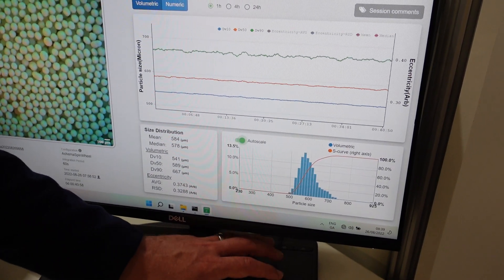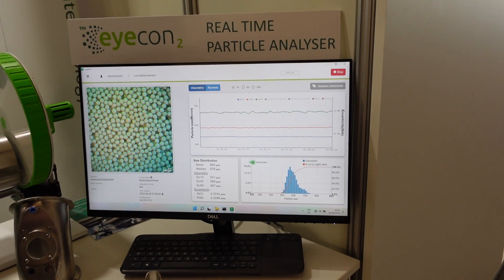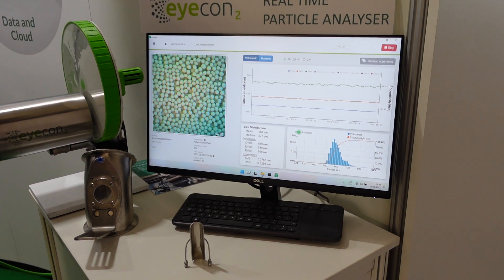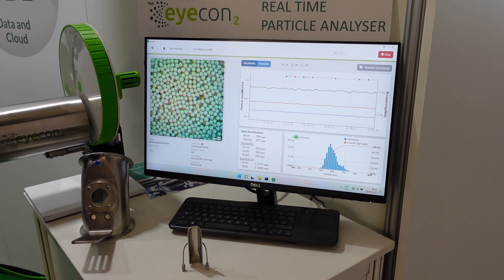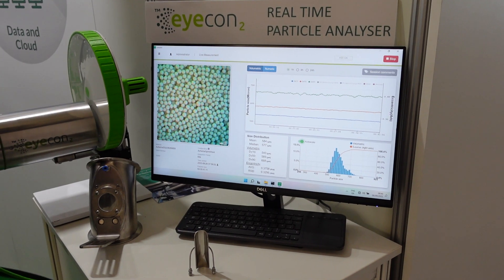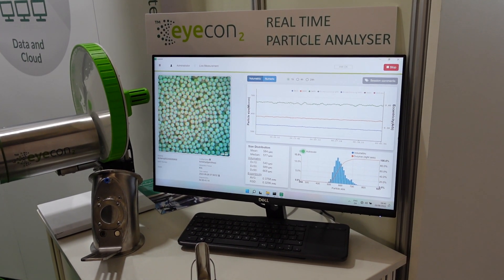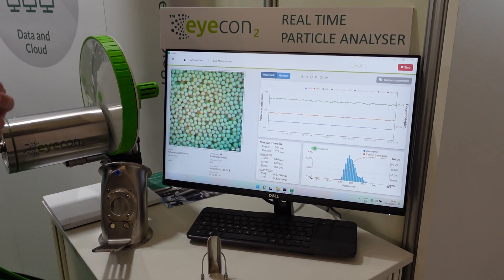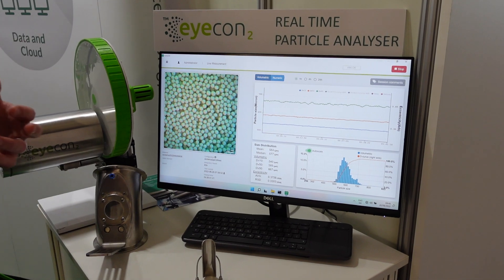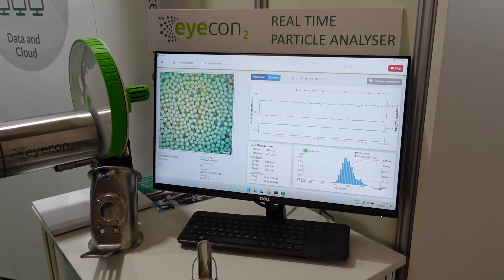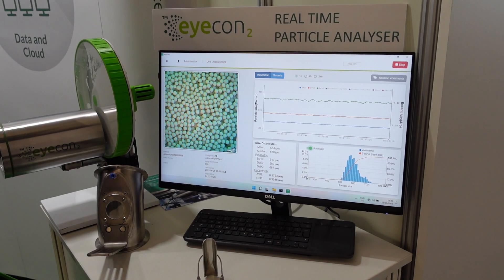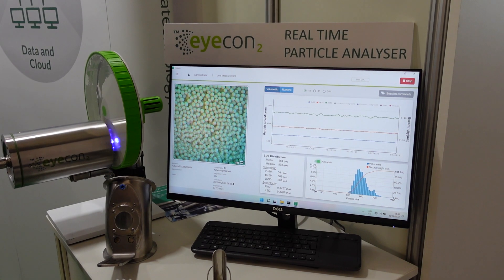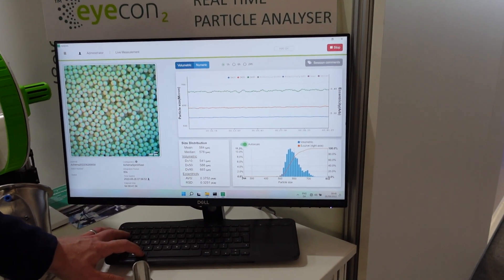The auto-scale is a really useful feature. Another key addition in version 3 of I-PASS is AI in the form of machine learning. In the back end, we've got images that have been trained for accurate particle size detection, which has allowed us to open this up to a much wider range of materials. We can now measure bulk solids in the form of crystals, shiny or reflective materials such as glass beads or sugar. There's a whole new range of materials you can now measure with I-PASS version 3.